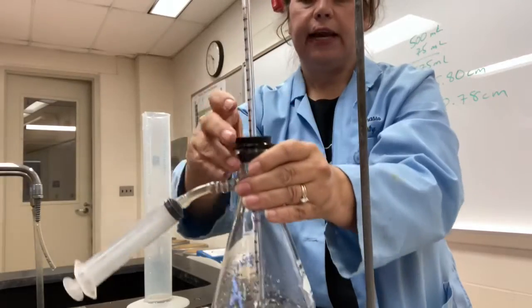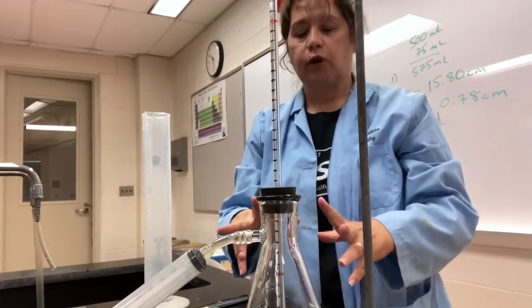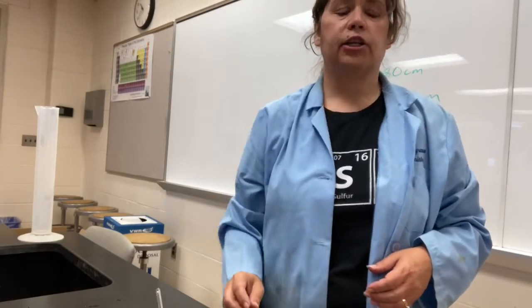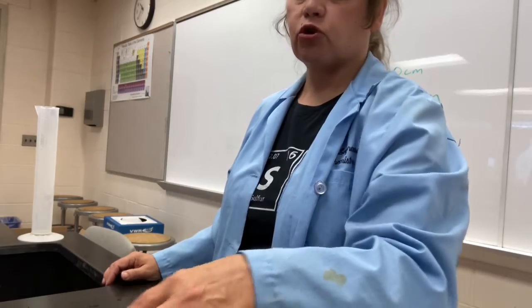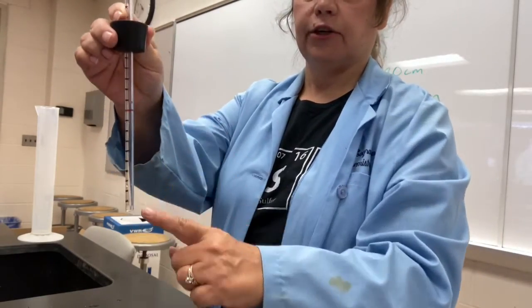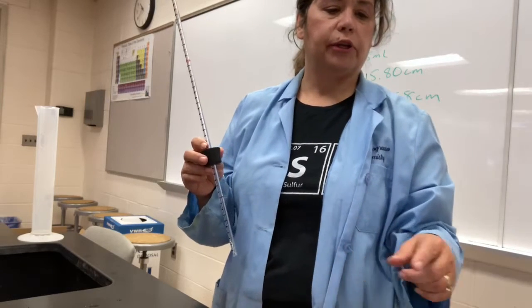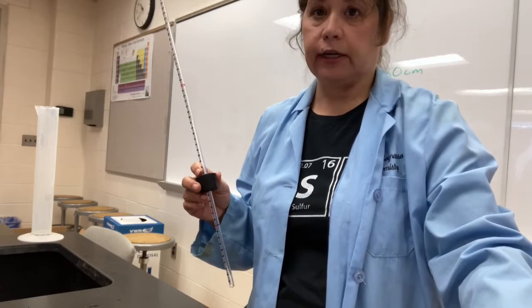So that means that as I put the cork in, the volume's decreasing inside the flask. Therefore, the pressure's increasing compared to atmospheric pressure, so it pushes some of the water up into the tube. To determine the volume that's actually in the flask, you have to take the entire volume of the flask, subtract off the volume of the cylinder, and then subtract off the 50 milliliters of water that you have in the flask. So when you calculate this through, you'll see for line 5, it tells you to do that.